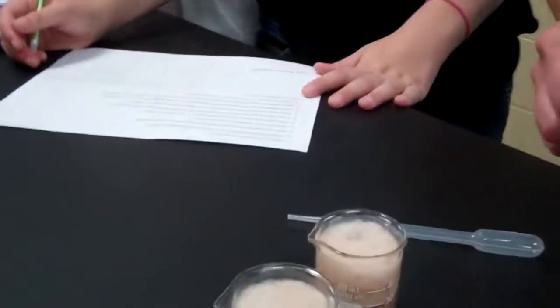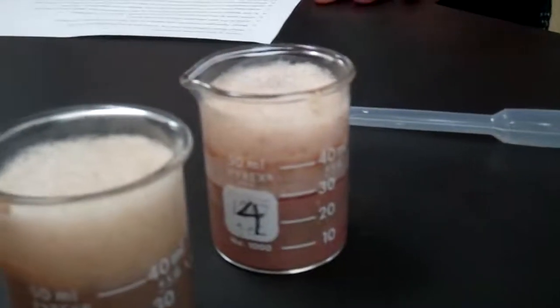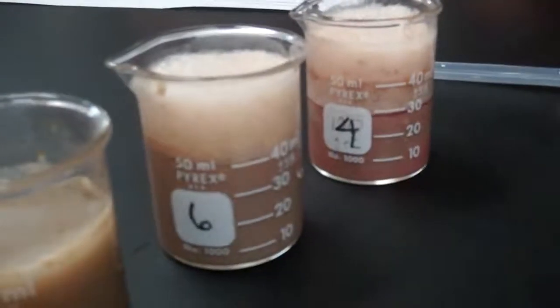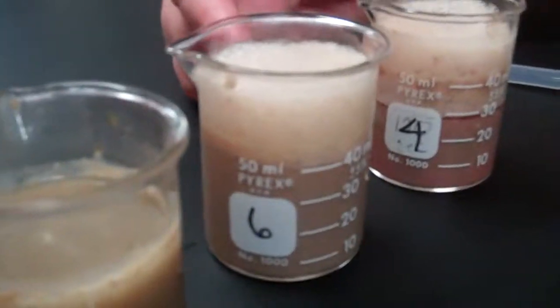Alright, so we need to talk about why these reactions happen. Why did the raw bubble and fizz so much? It had enzyme. Where's the enzyme? In the liver. So what is the hydrogen peroxide then? Substrate. Okay, so we added the hydrogen peroxide to the liver. It bubbled and fizzed because the liver had enzymes. All right, we'll come back to the base one in just a minute.